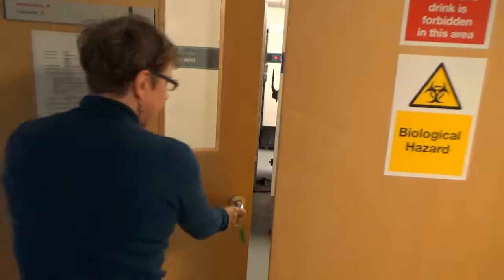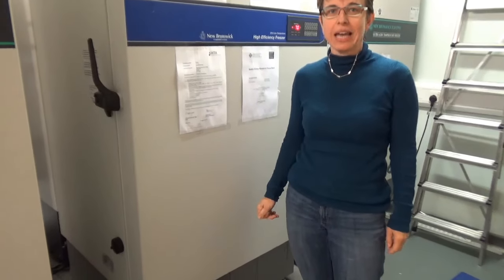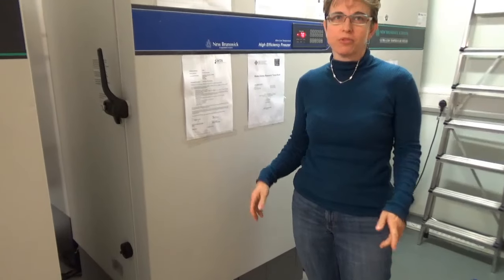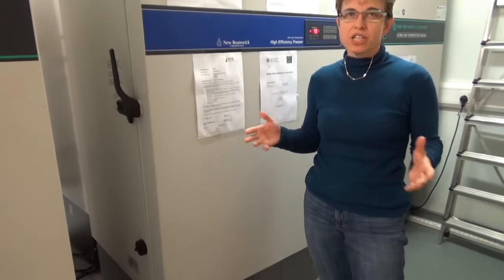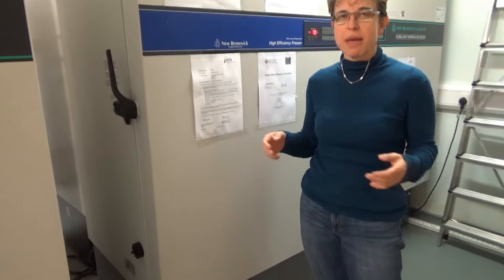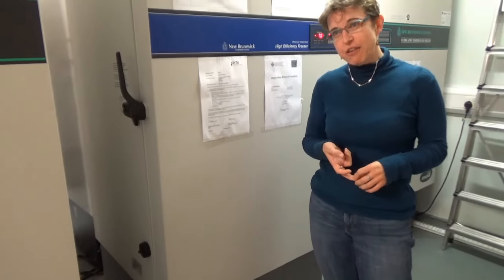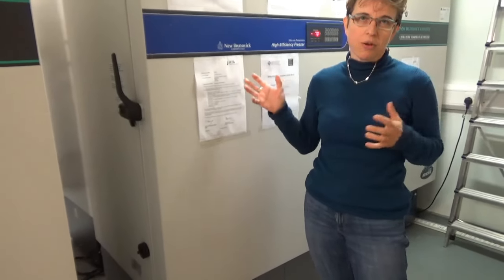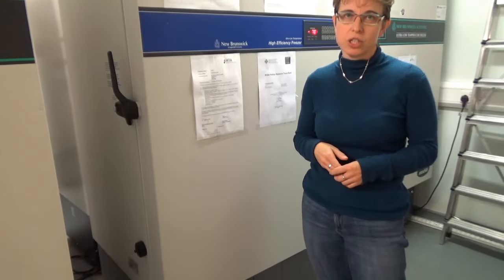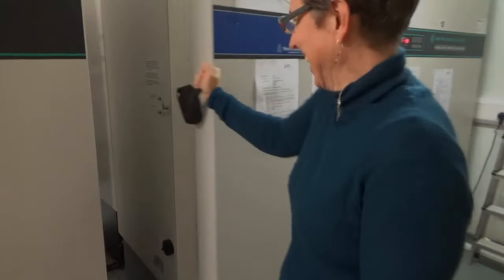This is the tissue bank. So we are in the freezing facility for the Wales Kidney Research Tissue Bank, which is a collection of samples donated by patients and healthy volunteers. So we have a range of various types of samples, mainly blood, urine, peritoneal dialysis effluent, kidney biopsies, which are kept somewhere else in the pathology lab of the hospital. But here we have all the other types of tissue, which are ready to be transferred to researchers when they apply to the tissue bank.